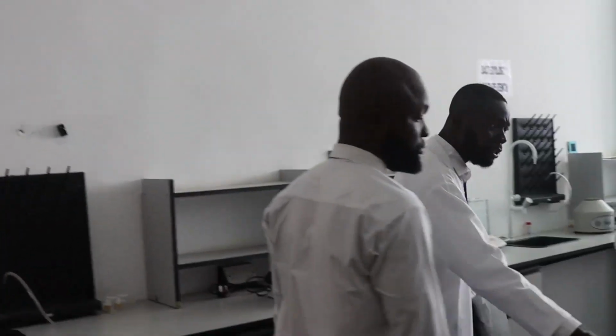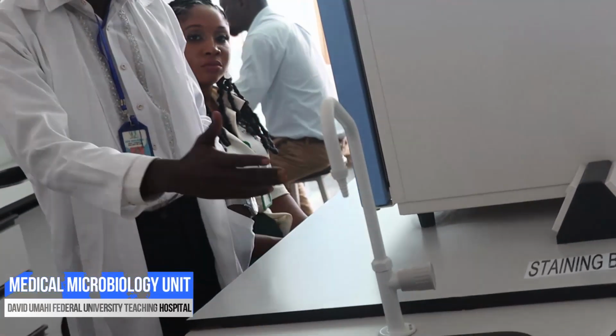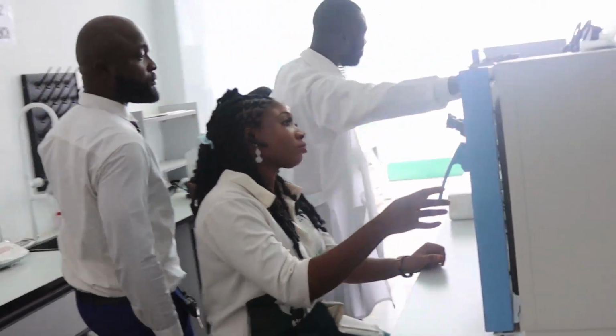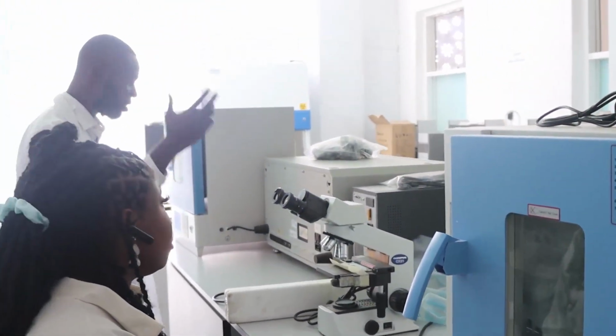This is our staining bench. We conduct virtually everything concerning staining. As you can see, one of our erudite scientists is working on it. This is our oven, the thermostat oven, where we dry certain things before we carry out our process.